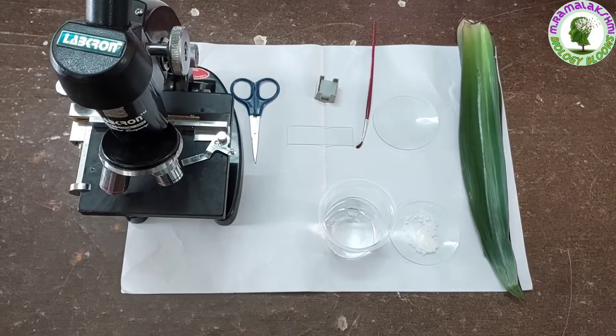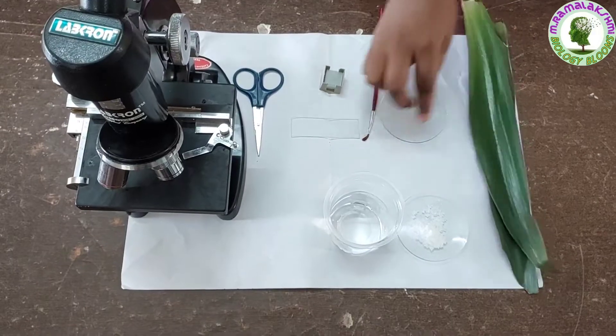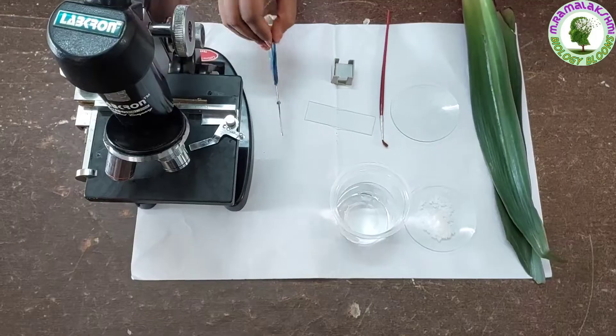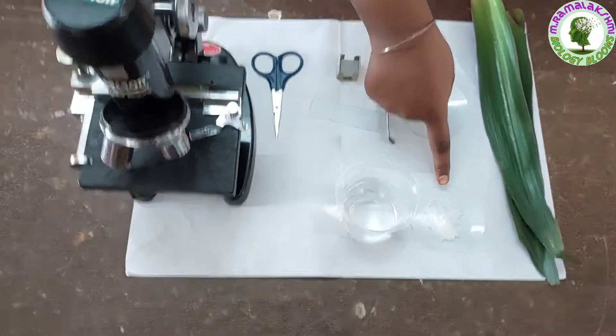For this we require reo leaf, watch glass, brush, slide, cover slip, scissor, water, salt, and microscope.